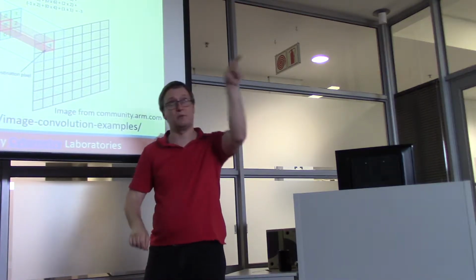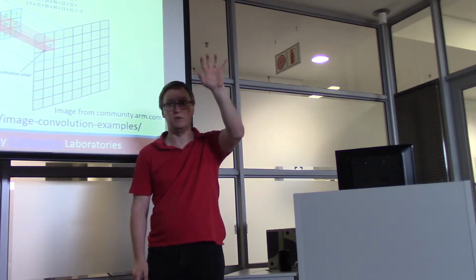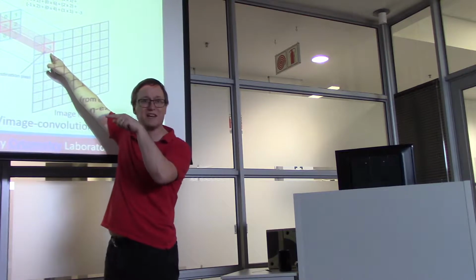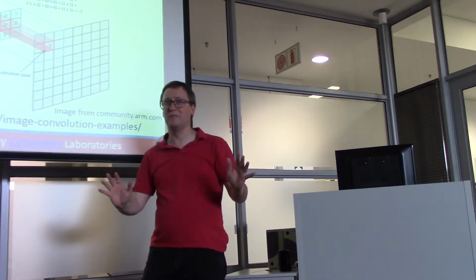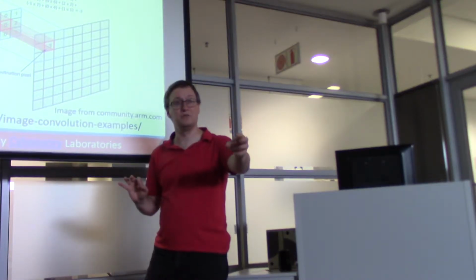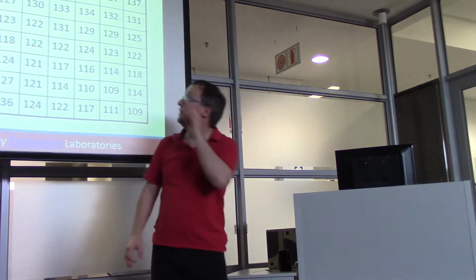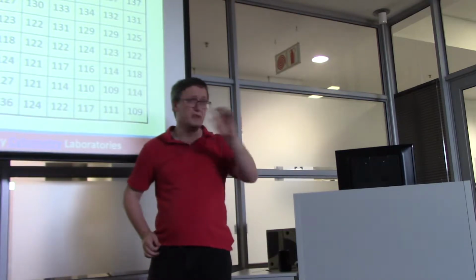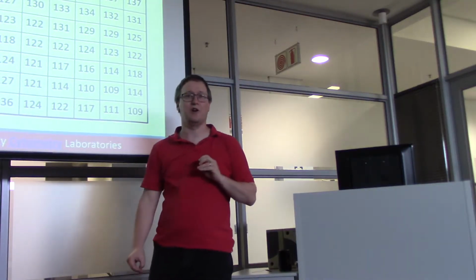So the first 3x3 grid in the input image is being used to create the second row, second column dot in the output image. Everyone sees that? Okay, but how do we combine multiple input values to create one output value? Now, which filter you're using has everything to do with what's going to result. So we're going to start with the Gaussian kernel filter.